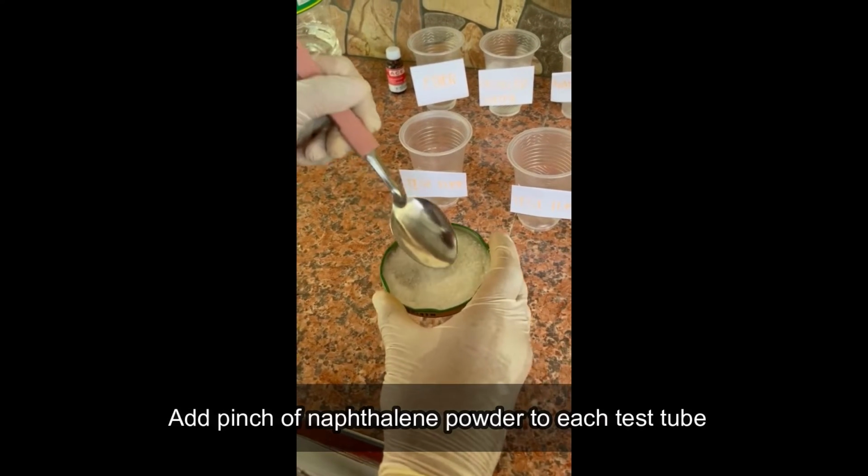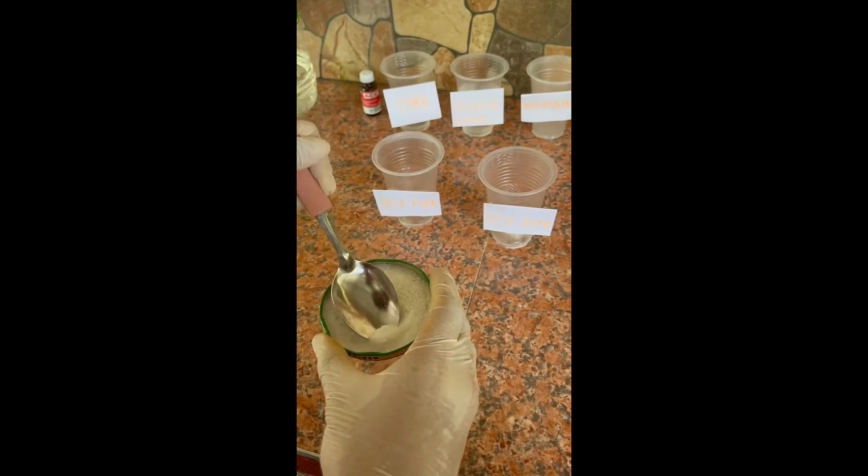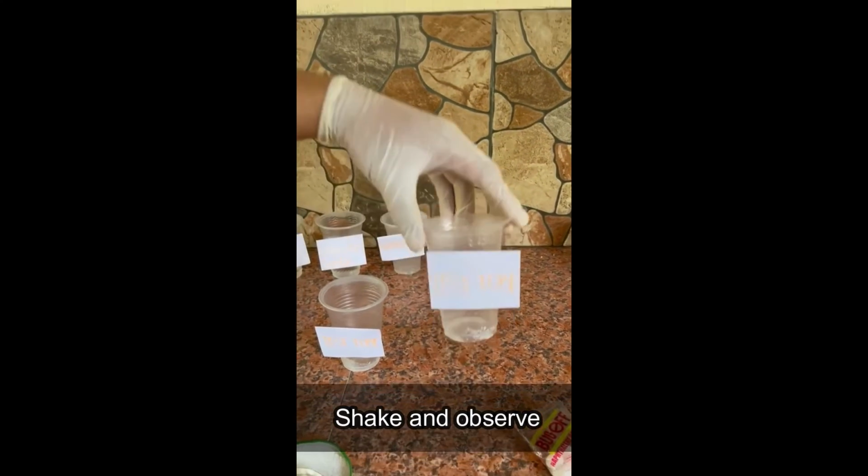Add a pinch of naphthalene powder to each test tube, and then shake and observe.